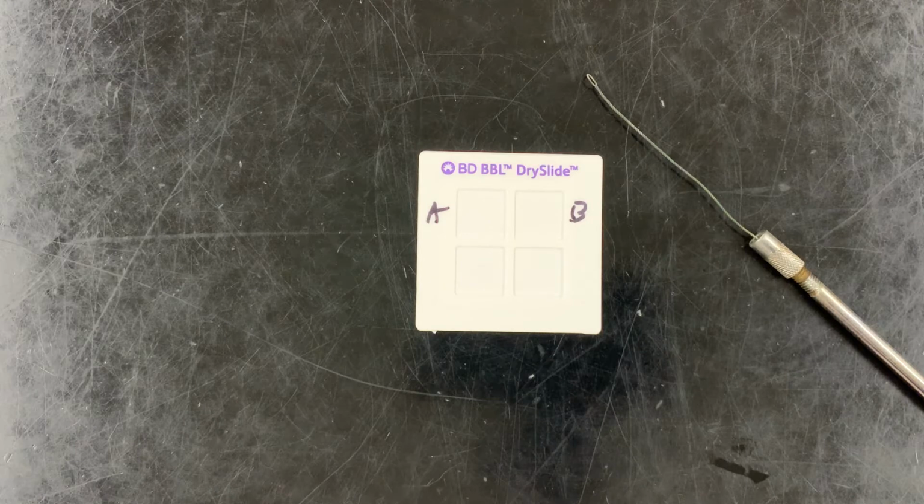Now, sometimes we get this confused with our catalase test, right? Because the reaction in the catalase test produces oxygen. This has nothing to do with catalase. This has nothing to do with whether this organism can grow aerobically or not. Oxidase is simply an enzyme that's within the membrane of our bacteria, and there's a very specific one here that we're looking at, right? So that's really all we're testing here, and again, using this as a presumptive test to determine whether our gram-negative rod is an enteric versus a non-enteric.